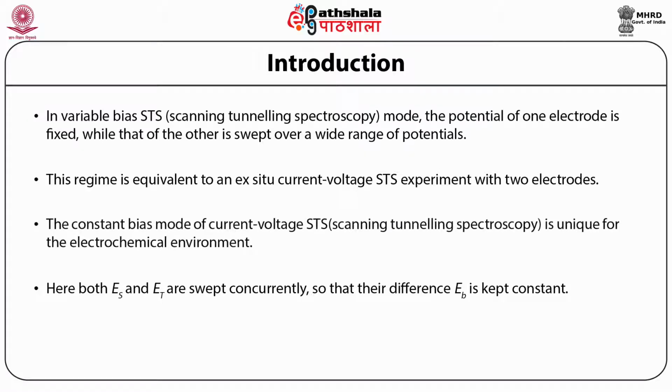The constant bias mode of current-voltage STS is unique to the electrochemical environment. Here, both ES and ET are swept concurrently so that their difference, EB, is kept constant. This is one of the important features of this technique called STM.